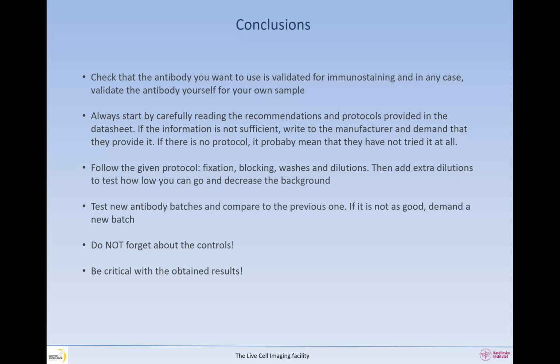Be critical with the obtained results. We are usually quite happy: I got the signal. But look carefully. Is it in the correct place? Is it in the correct context? Check the literature, and of course compare with the datasheet if any was available there. And remember, there is no such thing as a perfect protocol. Most protocols need optimization, and it's up to you to do that optimization.